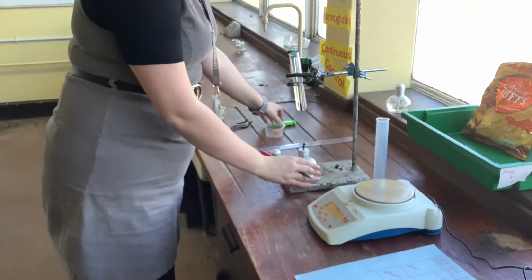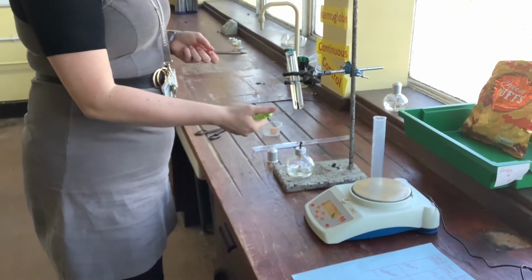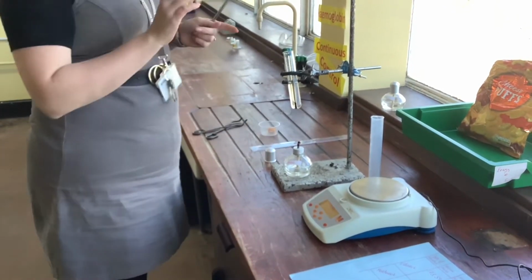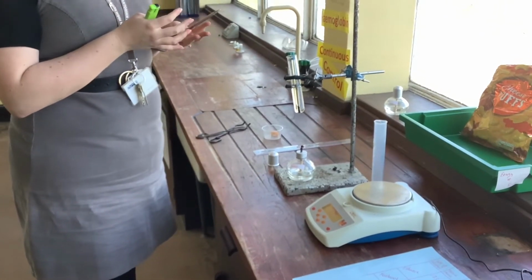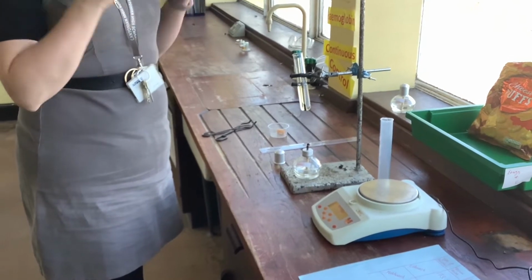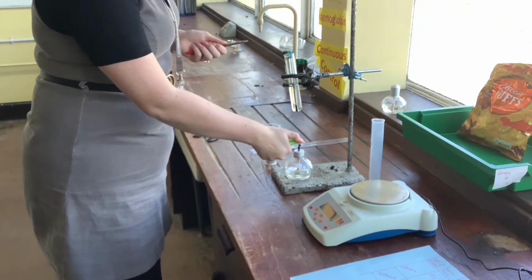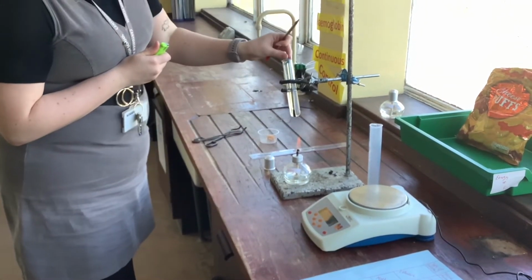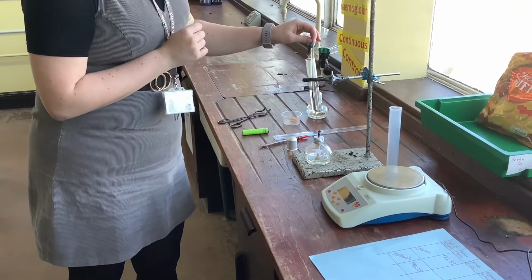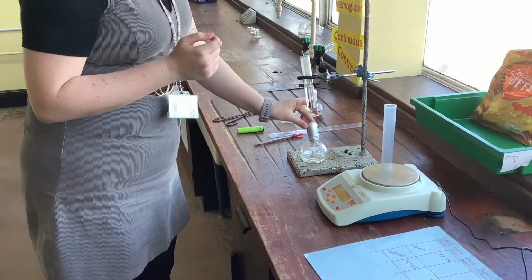Once you're all set up, and it's a good distance below, you need to light it up. We are going to record it until the temperature increases by 20 degrees. No, by 40 degrees. So we're going to record it until the temperature increases by 40 degrees. When the temperature has increased by 40 degrees, and this is now on 60 degrees, you need to extinguish your flame using your cap.